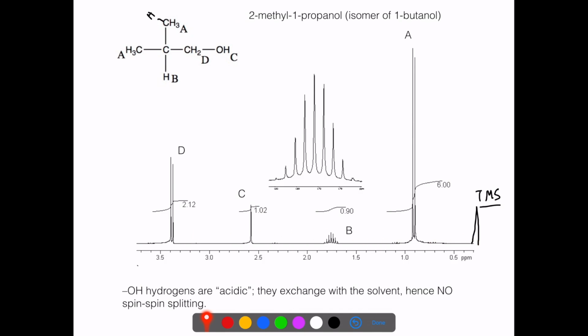And so you want to be fairly comfortable with looking at a spectrum such as this and being able to interpret and pick out, say, given 3 molecules, which spectrum goes with which molecule, or identifying a compound based on its spectrum. And you're going to get opportunity to do this both in some of the lecture material and the laboratory material.